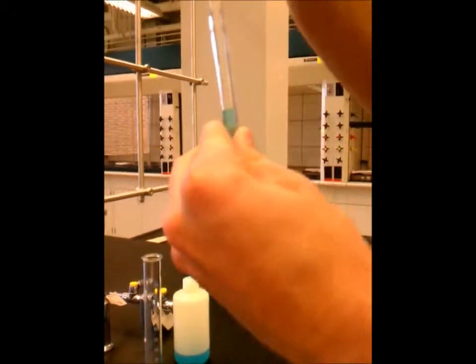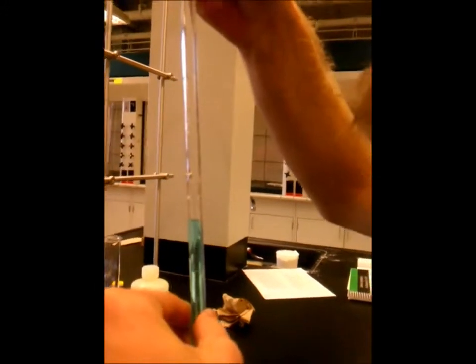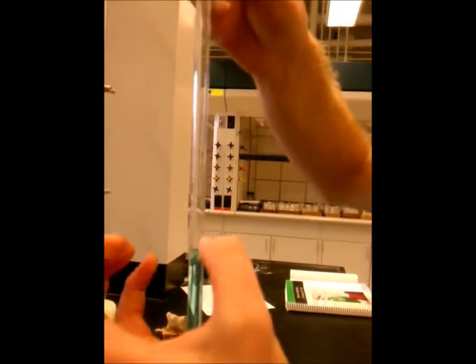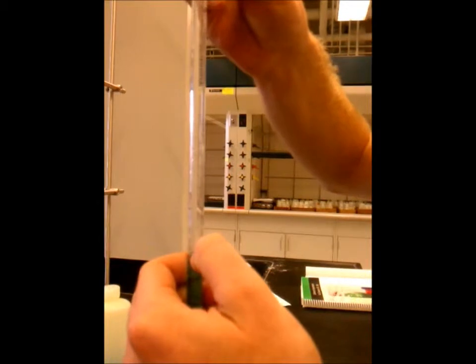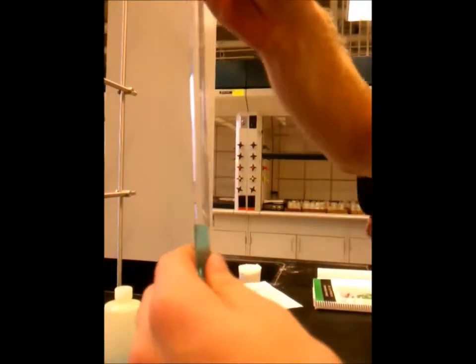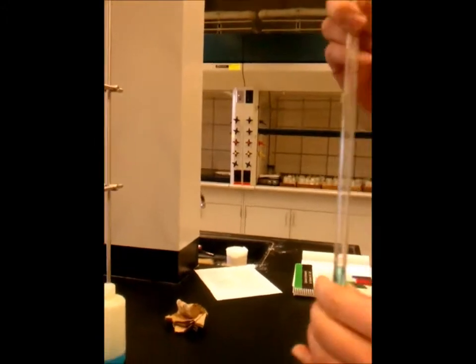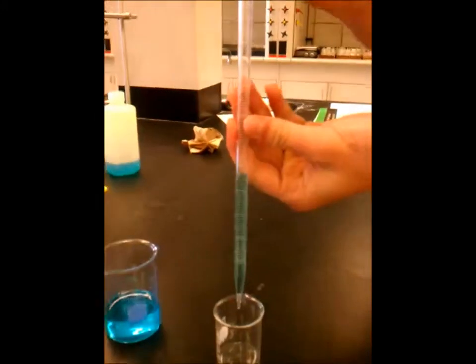What I'm going to do now is look to see how much I have in there. I'm going to measure to the 100. And we're going to measure by the meniscus. The meniscus is the concave dip we have in the water. The outside is the water is attracted to the glass, and that's why we have a meniscus. My measurement is 6.27. I'm going to let it out to a certain point, and I'm going to subtract my final from my initial.